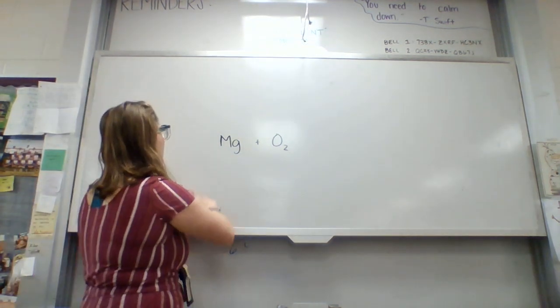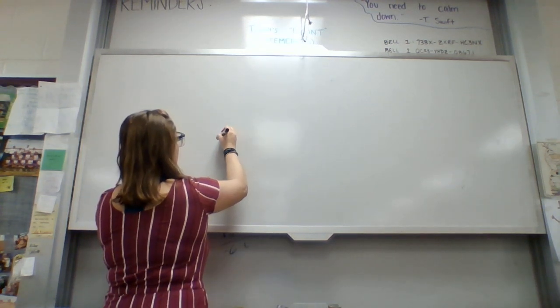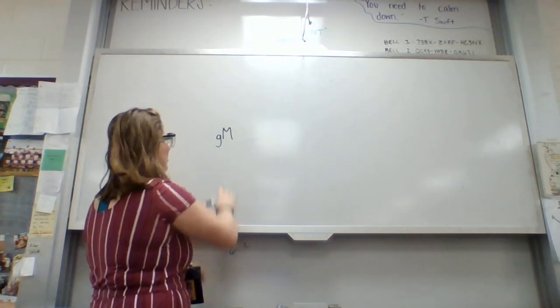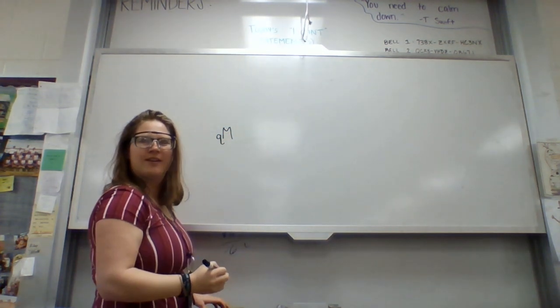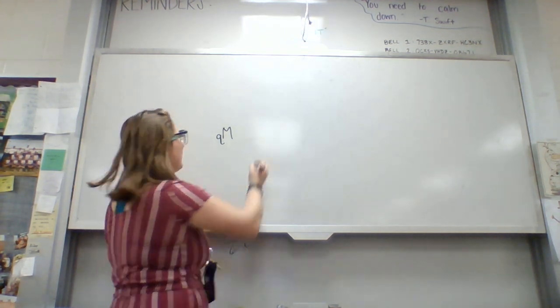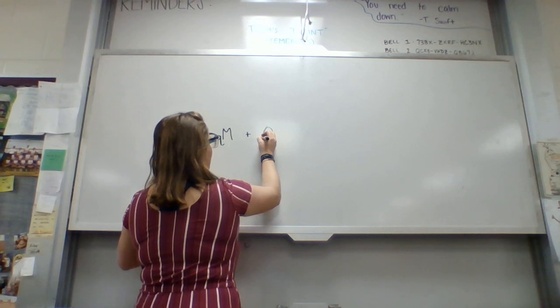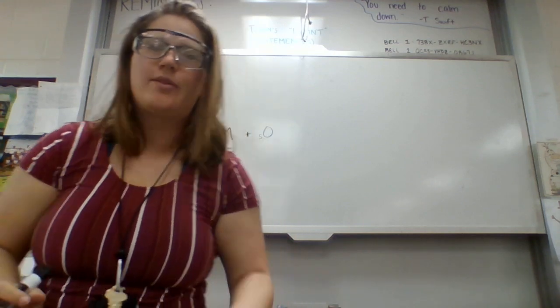Should I try and write backwards? I'm going to do it. Let's see how this works. That G is wrong. That's not bad. Woohoo! Mg plus O2. All right, cool, we've got that.